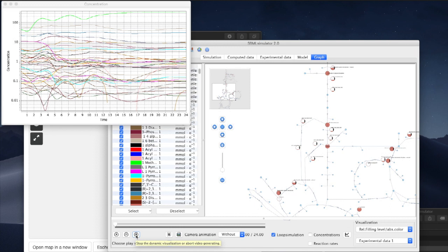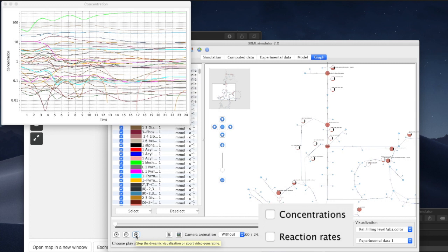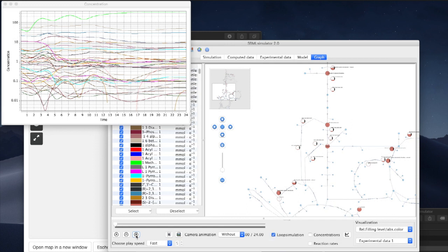If we want to display the exact values of metabolite concentrations and so forth, we just need to check the boxes to the right. Since we can adjust all of this while the animation is still ongoing, this really is a seamless animation.